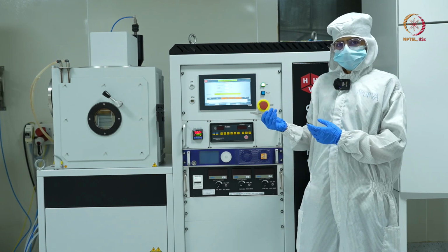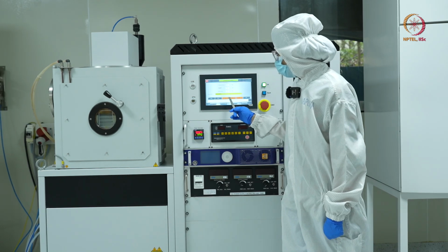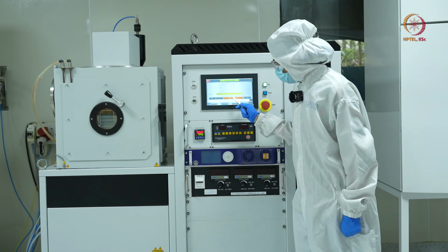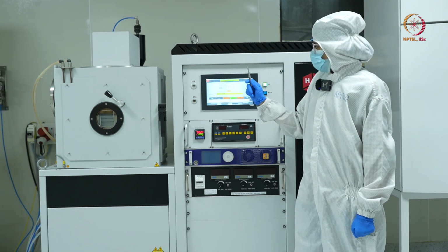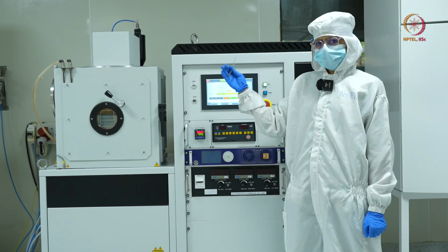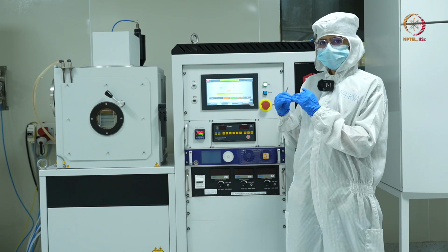To go into deposition mode, there are three options now available: seal, process, or vent. I'll go into process mode. Once I have pressed process, the backing valve, which was sucking out the air from the vacuum chamber, is now partially closed.